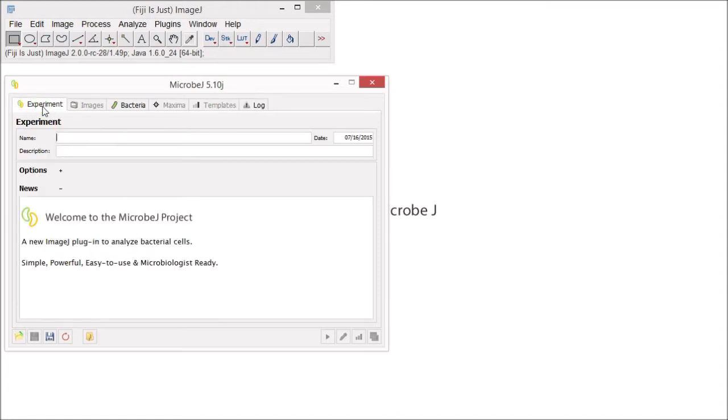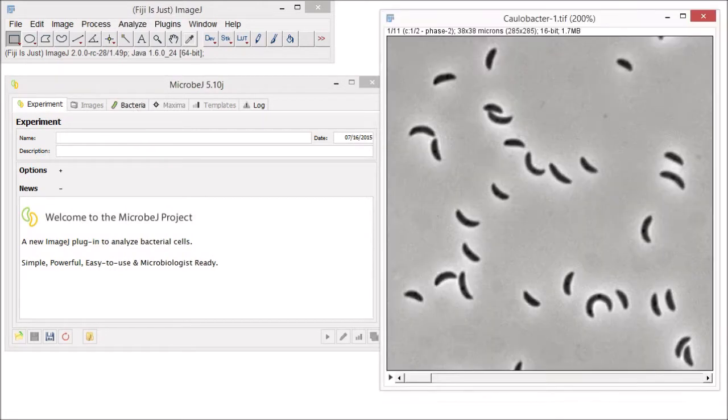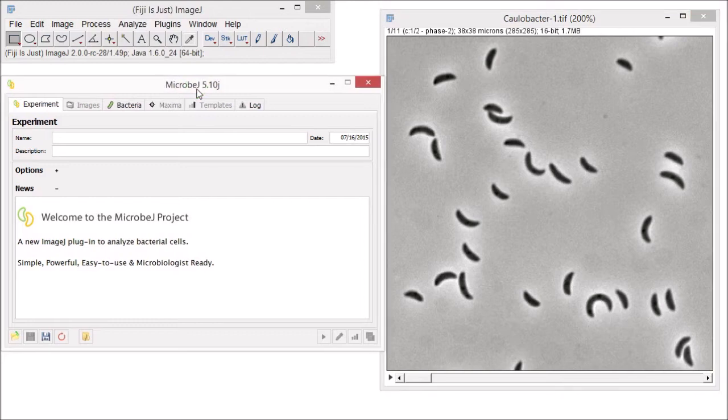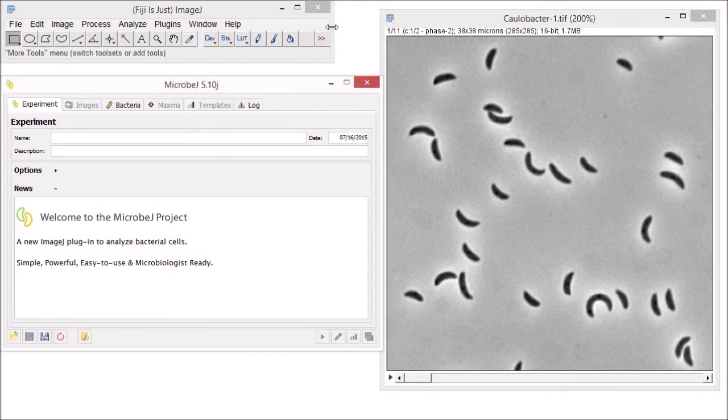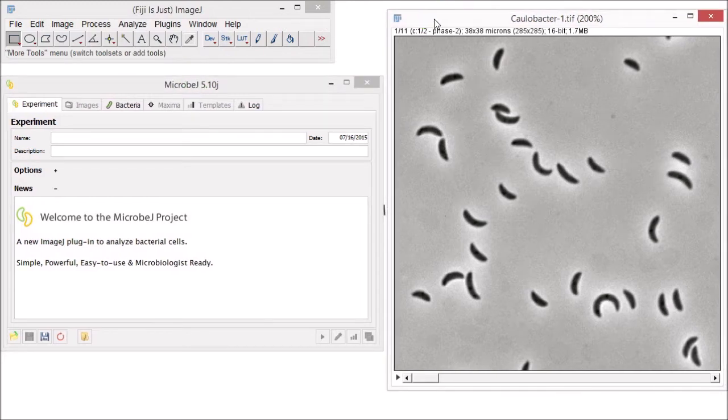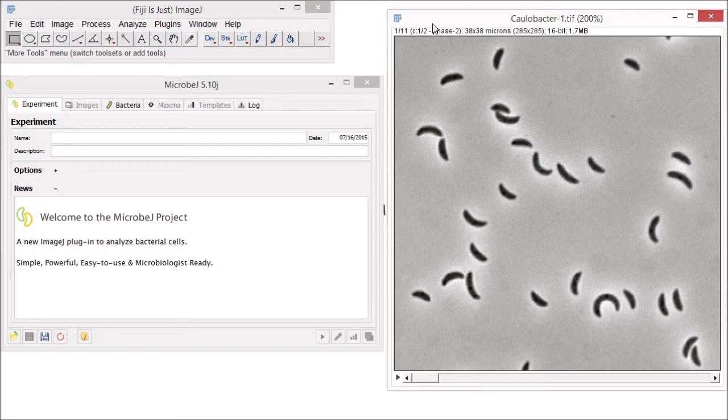In this video, we will explore the features in the Experiment, Images and Bacteria tabs by starting with this stack of phase contrast images and show you how to optimize detecting cells, extract simple information like length and width, perform simple statistical analysis, and graphically represent your data.